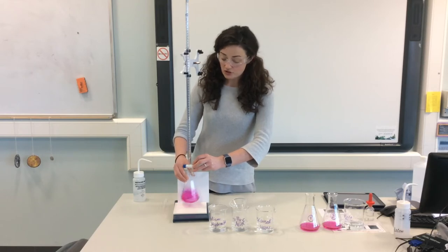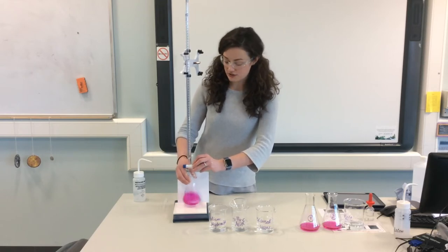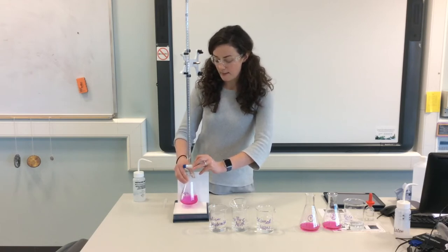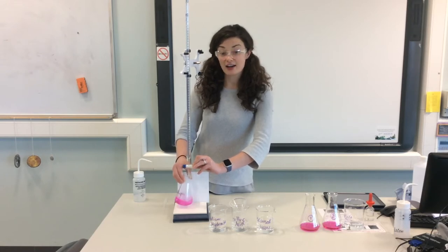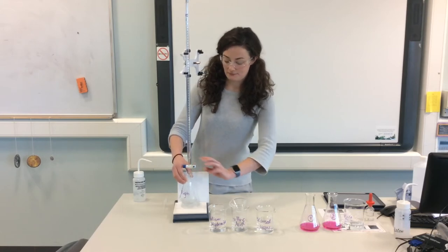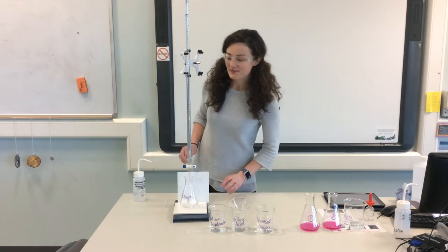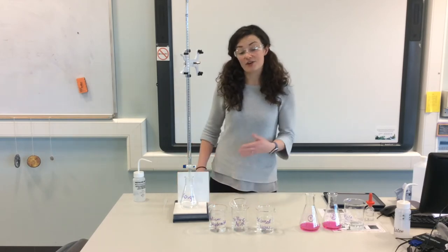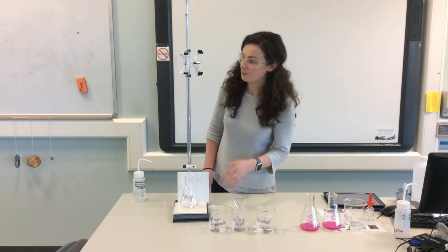So you don't need to do this particularly carefully. You can just add the sulfuric acid quite quickly. You can stop every now and again to give it a good swirl. And when you start to see that pink colour fade, you can maybe add it a little bit more slowly. Remember, we don't want this to be too inaccurate. Oh sorry, I added a wee bit extra there. Hopefully that will not interfere with our results. So let's have a wee look at this. We can see the colour change is now complete. It has changed completely from pink to colourless.